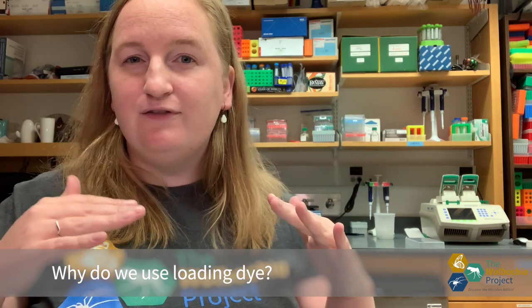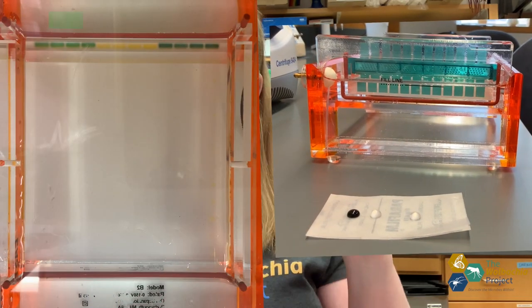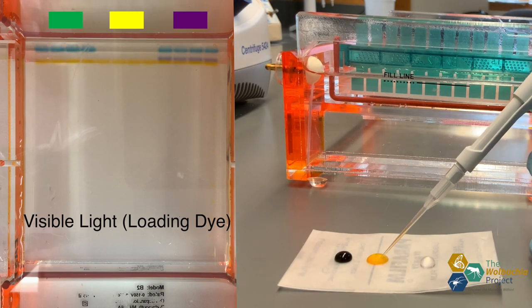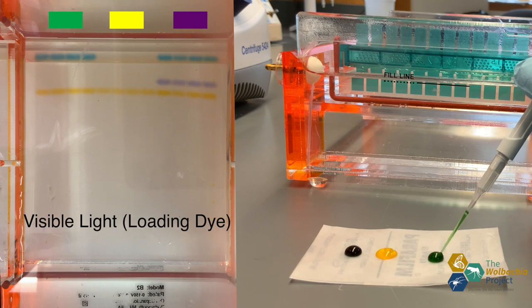DNA is colorless, so how do we know the DNA has run enough through the gel? We add a loading dye, which is normally green or yellow. The loading dye separates into its component colors — green dye separates into blue and yellow. The yellow dye has the shortest molecular fragment size, so it moves the fastest, and it happens to be about the same size as the smallest DNA fragments. That's why you want to run your gel until the yellow is about three quarters down the gel.